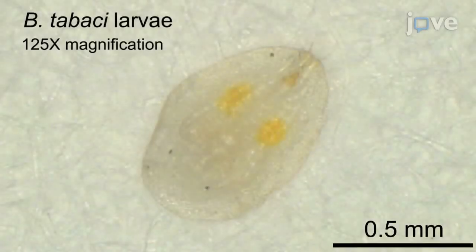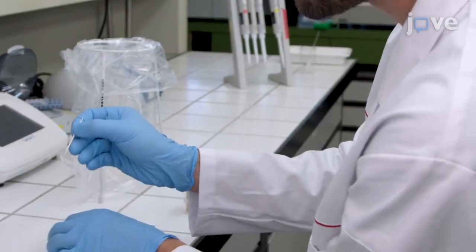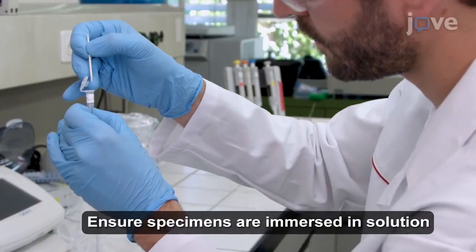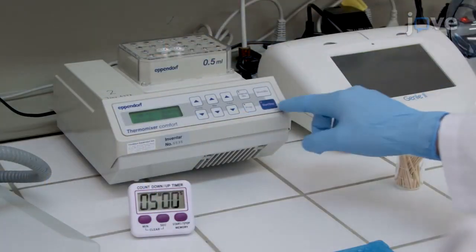To begin DNA extraction, use sterile toothpicks to transfer the insect specimens into 0.5 mL microcentrifuge tubes with 30 µL of DNA extraction solution. Then incubate the samples for 5 minutes at 95 degrees Celsius.